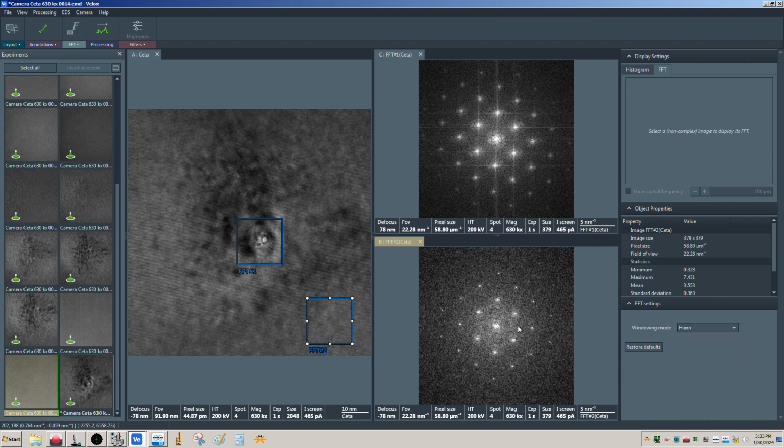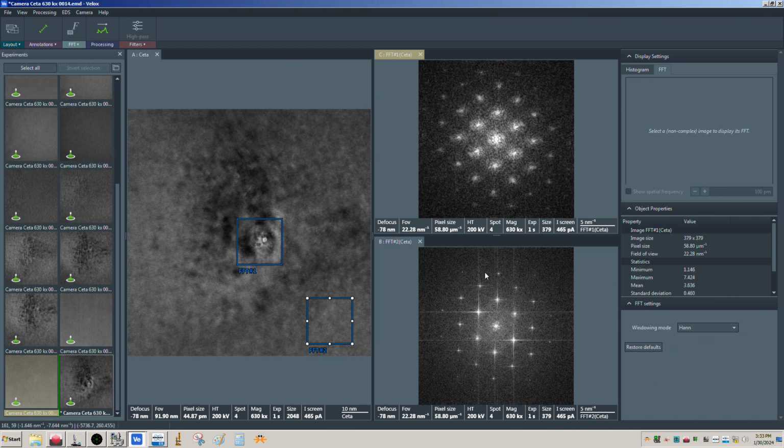You do lose a little bit of detail though when you remove the streaks. So you can see the spots, they don't quite look as tight even though you remove the streaking. So if we do the same thing here, and we do the same thing here, okay, you can see the difference here, okay?